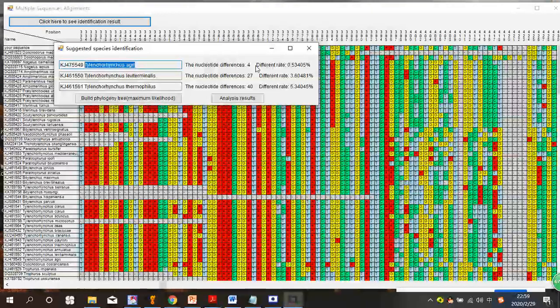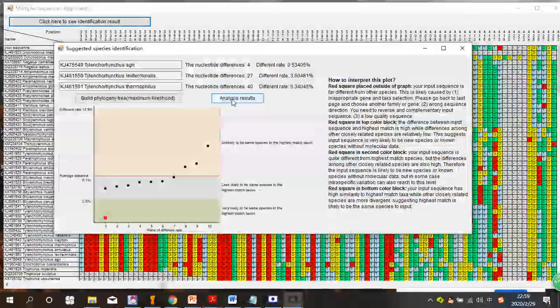This stage usually causes some problems. Because of this, we don't want to make too subjective a decision, so I developed a method that helps you make a better decision.